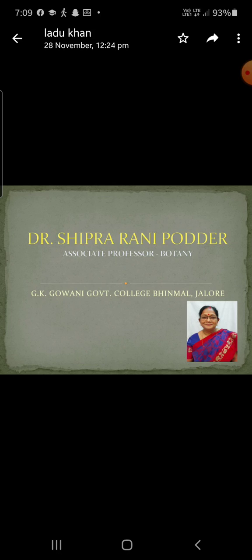The epidermis is followed by hypodermis, which is composed of two types of cells. The outer 2 to 3 layers are composed of thin wall chlorenchymatous cells and the next 4 to 5 of sclerenchymatous cells. There are 2 to 3 layers of sclerenchymatous cells on the adaxial surface of the rachis. Next to the hypodermis is the parenchymatous ground tissue with many mucilaginous canals.